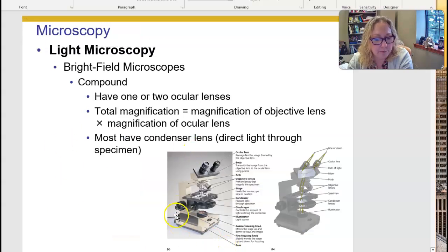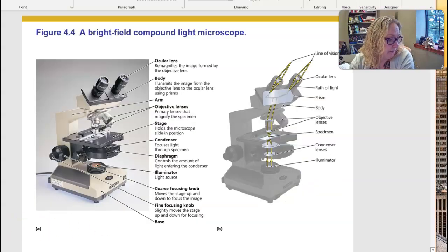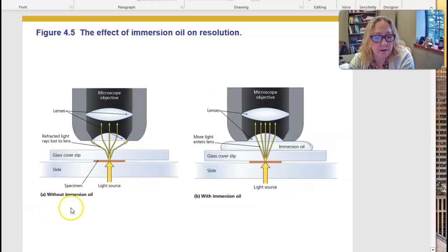Again, parts of the microscope, you're going to start fiddling here. You're going to start on 10. You're going to start 15. Then you're going to start here. You still can't see it. You're going to mess with the light. Do you need more or less light? Then you're going to mess with the condenser. Maybe I need it condensed or more condensed. And you're going to just keep that up until you can finally focus it. And then you're going to yell for me.